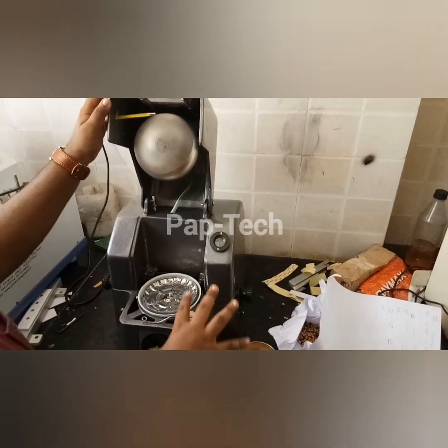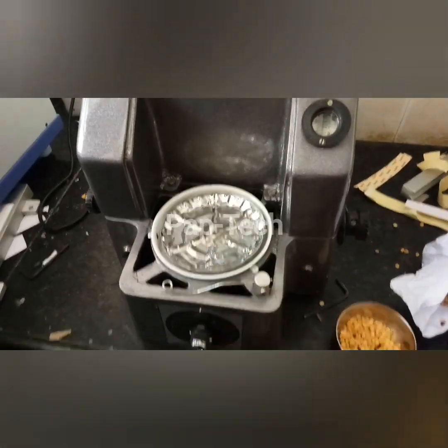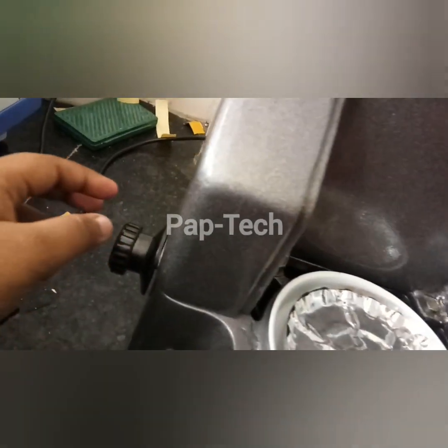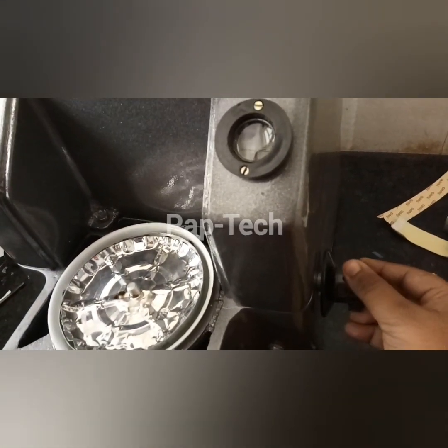This is an infrared moisture balance. It has a thermometer, an infrared bulb, a plate to test the content, a scale for temperature, a scale for setting the weight value, and one scale for setting the moisture percentage.